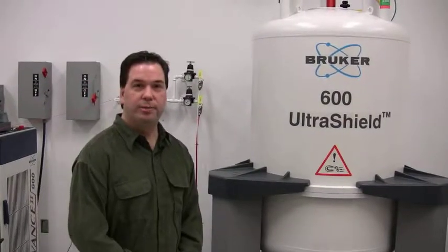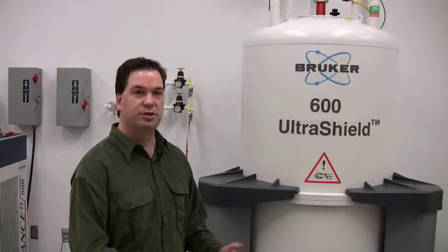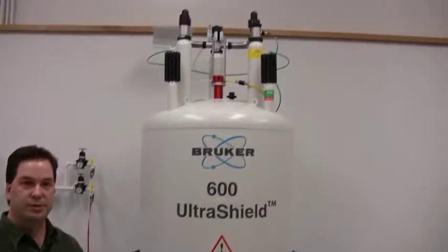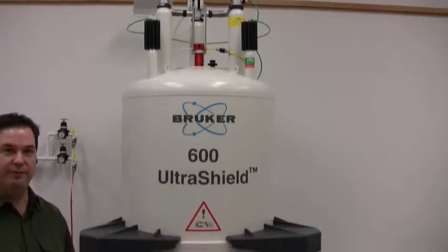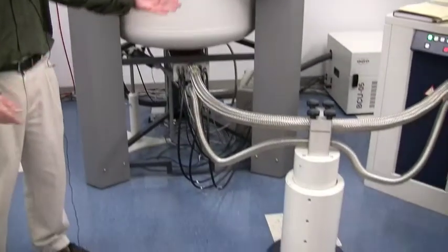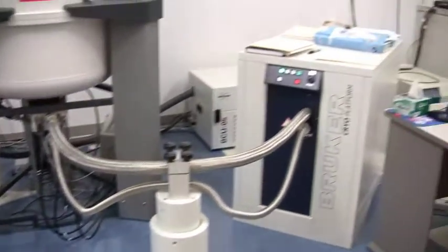This is a 600 megahertz spectrometer. This is the newest spectrometer in the facility. This is the latest Bruker, what's called an AV3-type console, and as you can see, it's equipped with a cryoprobe.